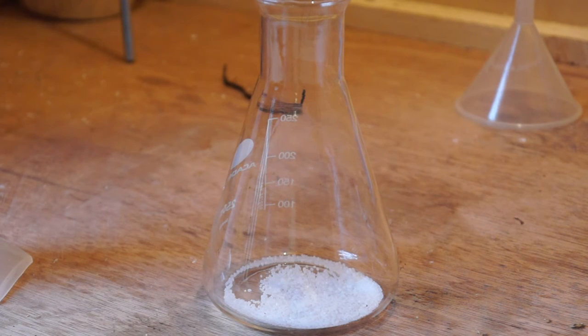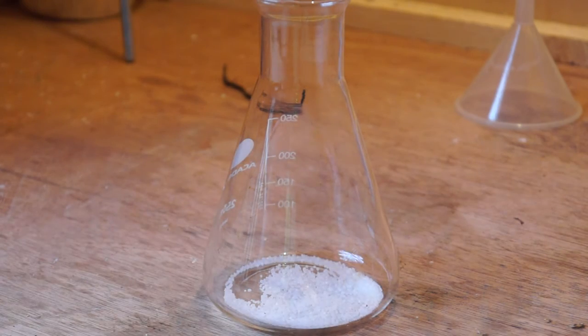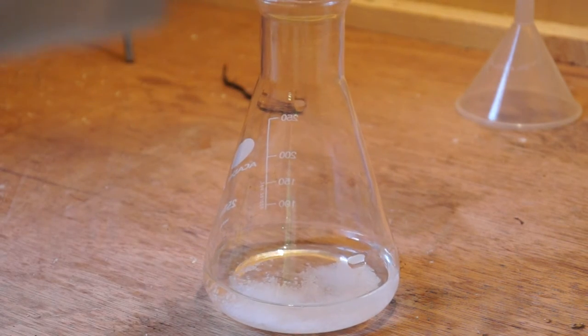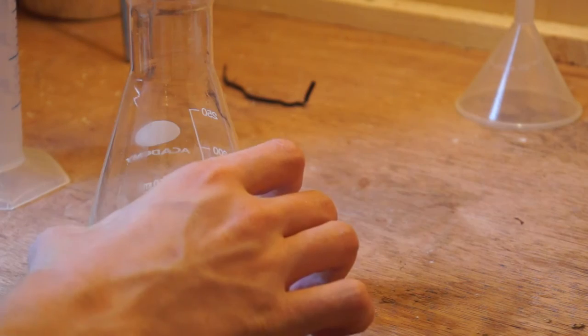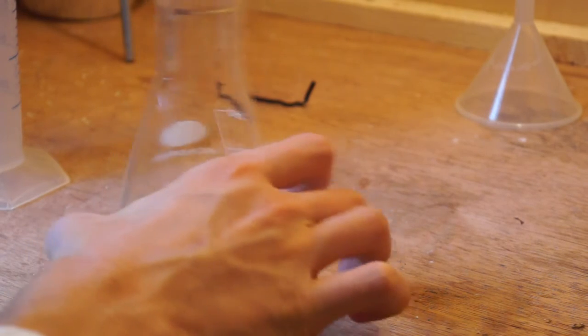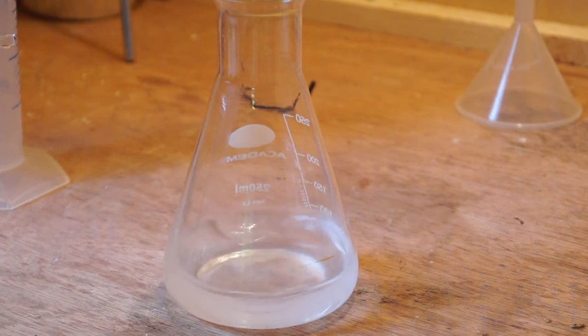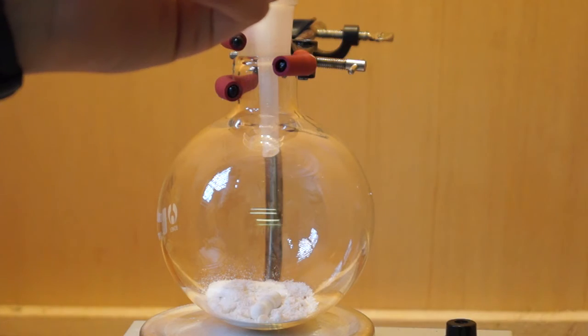First, I calculated that for the 7.5 grams of aspirin I had, I would need 5 grams of sodium hydroxide to completely hydrolyze the aspirin molecule. This was calculated using the stoichiometric equation. I then prepared a 2.5 molar solution of sodium hydroxide by dissolving 5 grams of pure sodium hydroxide in 50 ml of deionized water.